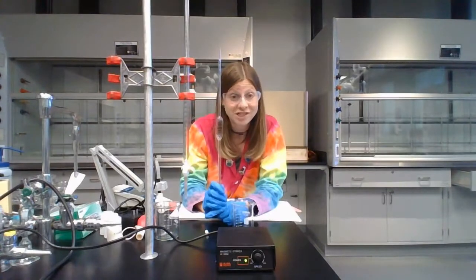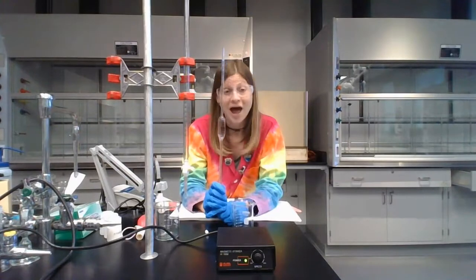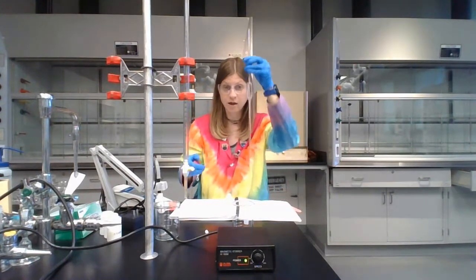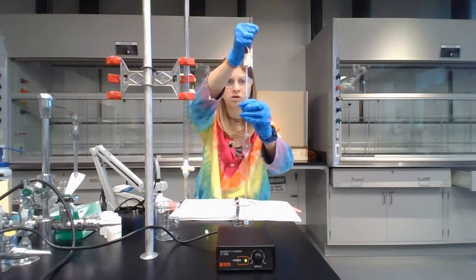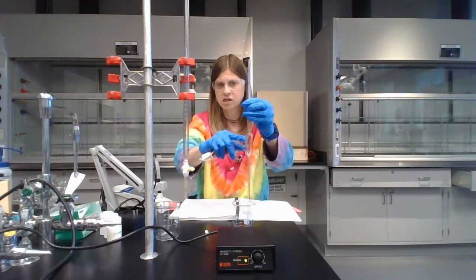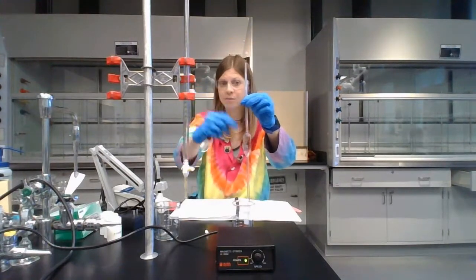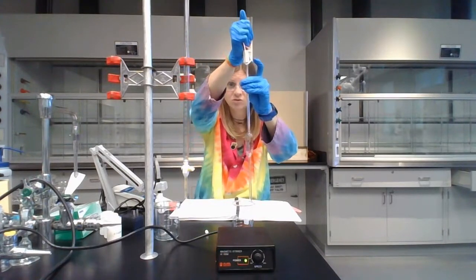Now, we do have to condition this volumetric pipette just like we would any other volumetric pipette. When I use the 25 milliliter pipette, it takes me more than 1 bulb full of air. So like when we're using our pipette, I submerge it in the liquid in the beaker, compress the bulb, release the bulb until the liquid moves up. For me, the liquid gets to about here, and then I'm not done yet. I need another bulb full of air. So if that happens, your bulb has stopped pulling the liquid up, but the liquid's not high enough. Just put your finger on top, compress the bulb again, and then do it a second time.